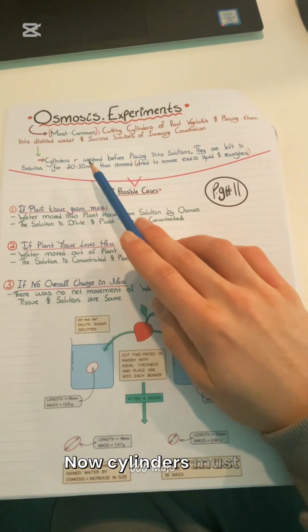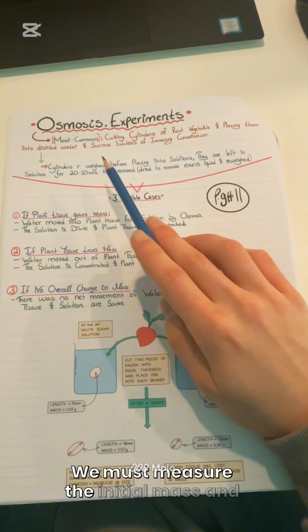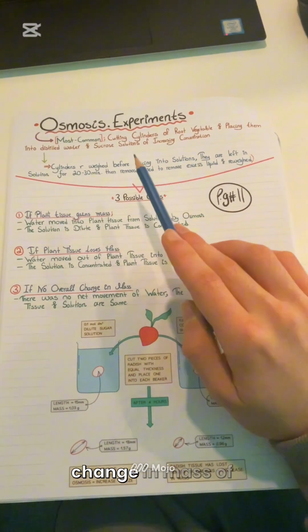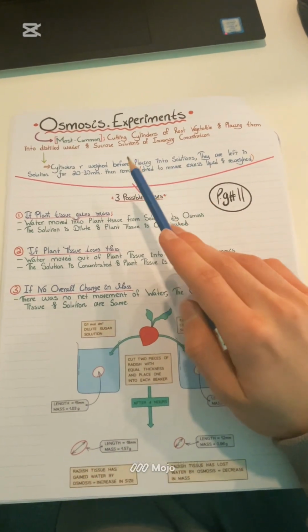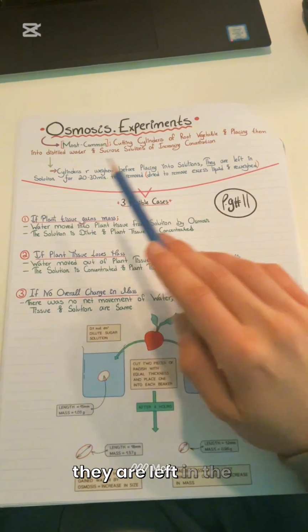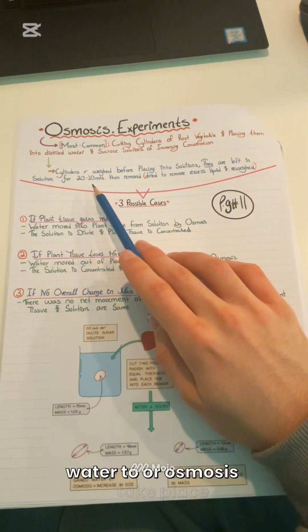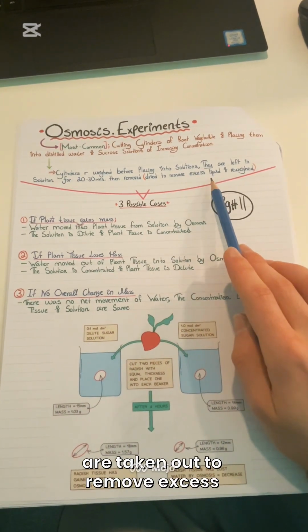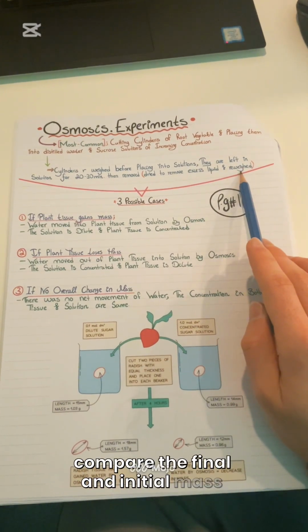Now, cylinders must be weighed before you place them into the solution. We must measure the initial mass and the final mass to then identify the change in mass of the cylinder and identify whether water has moved into or out to investigate osmosis. Okay, they are left in the solution for 20 to 30 minutes, enough time for osmosis to take place, and they must be dried after they are taken out to remove excess liquid and then reweighed. All right, reweighed to compare the final and initial mass.